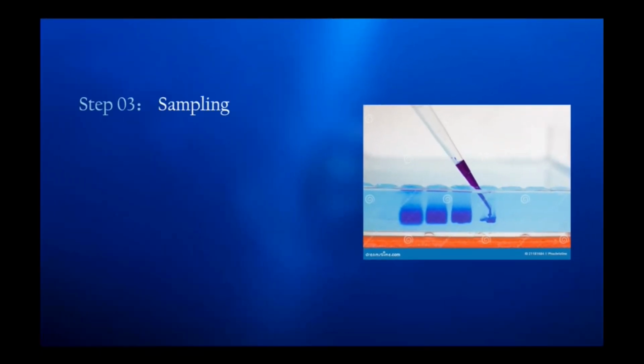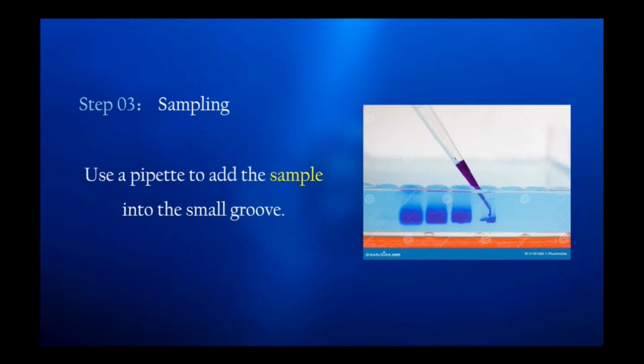And here's step 3, sampling. Use a pipette to add the sample into the small groove.